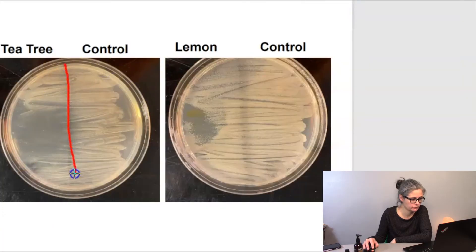So I put my line down the center here. I swabbed the entire plate and I dropped two drops of tea tree oil over here. And you can see that it completely inhibited the growth over here, which is awesome.